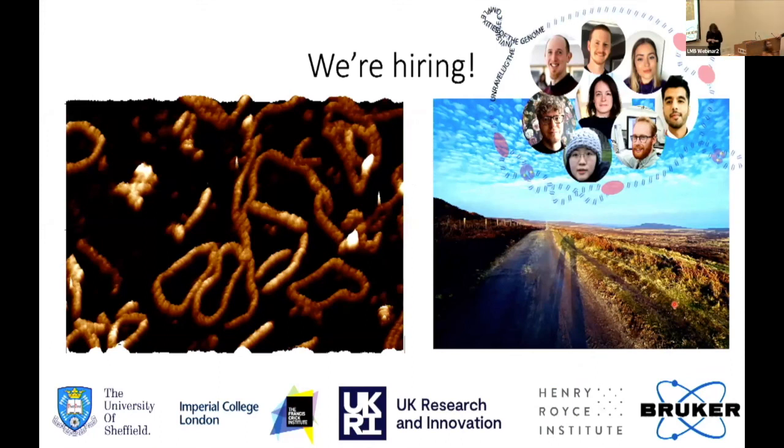Years, I'm talking decades ago, it was predicted that dislocations in DNA would localize apices in supercoiled DNA. So it's beautiful to see it. The question I had was, you compare different topoisomers. Obviously you're limited to unit changes in linking number when you do that. Have you tried adding, more delicately, say, ethidium bromide or some sort of intercalator to almost titrate between those points in terms of superhelical stress?